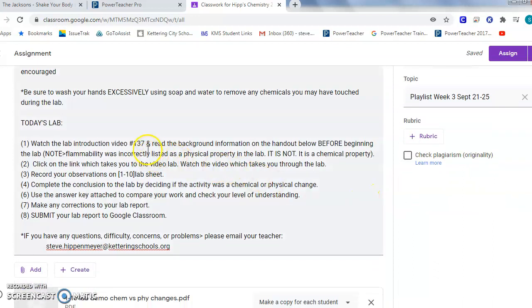Right now you are watching video number 137, which is the introduction. From here you're going to proceed on and do the lab. The link to the lab is right on our lab sheet. Watch the video. It will take you through a series of things, and you will merely be recording observations. At the end, you will decide if what you saw was a physical or chemical change.